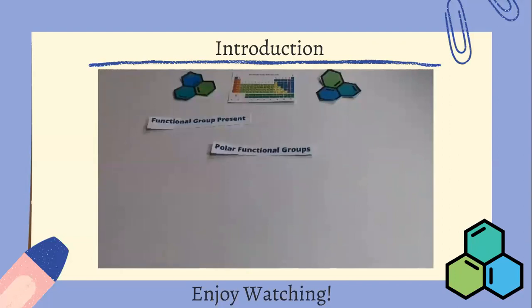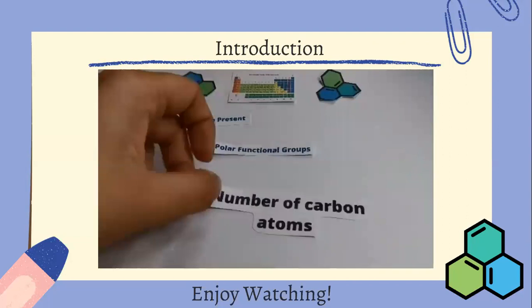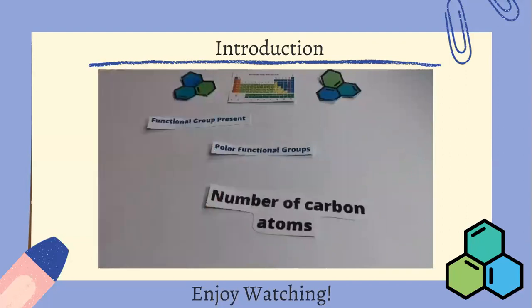Finally, the number of carbon atoms may also be deduced from its solubility behavior. Acetic acid, which has only 2 carbon atoms, dissolves in water, but benzoic acid, which contains 7 carbon atoms, does not, even though acetic acid and benzoic acid are both carboxylic acids.